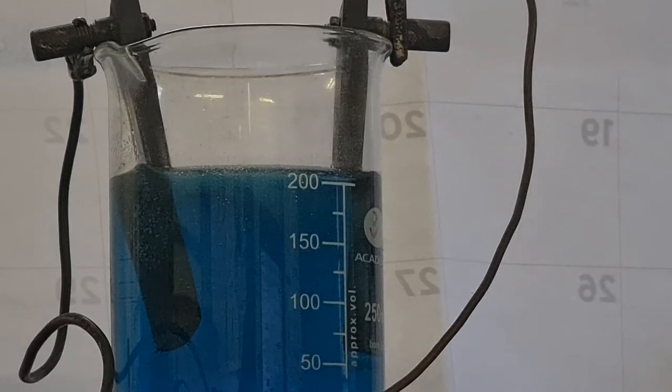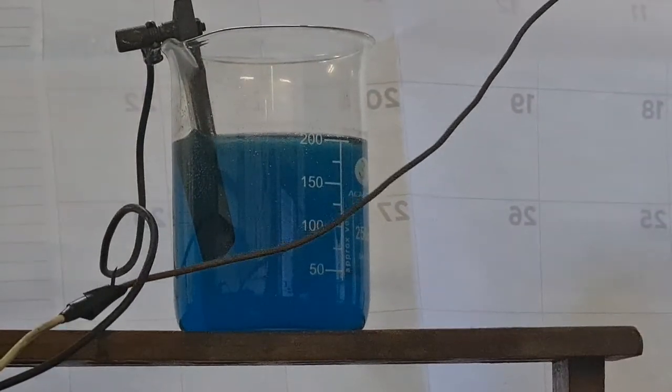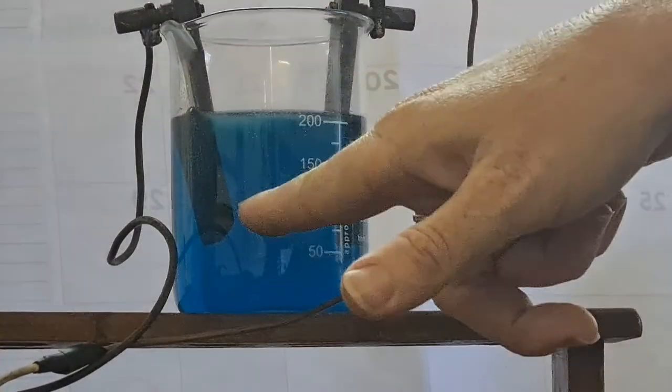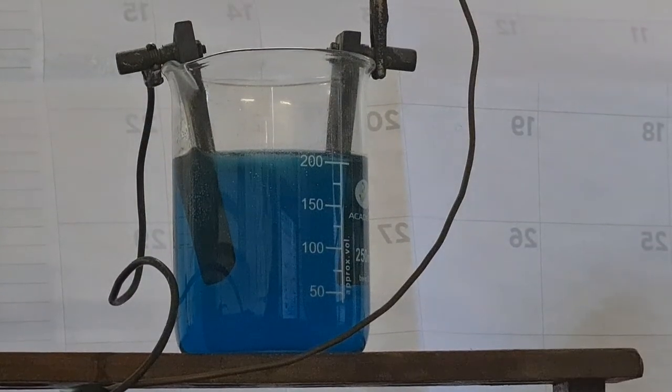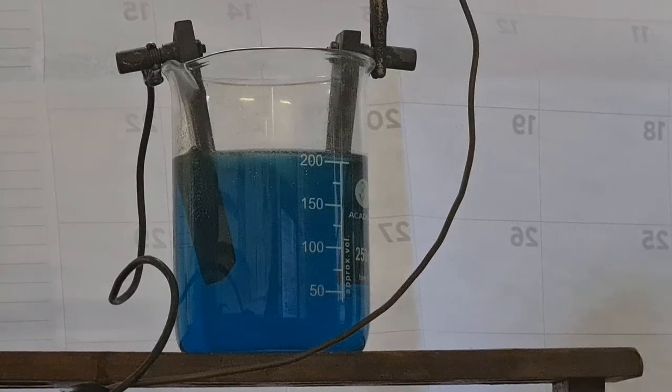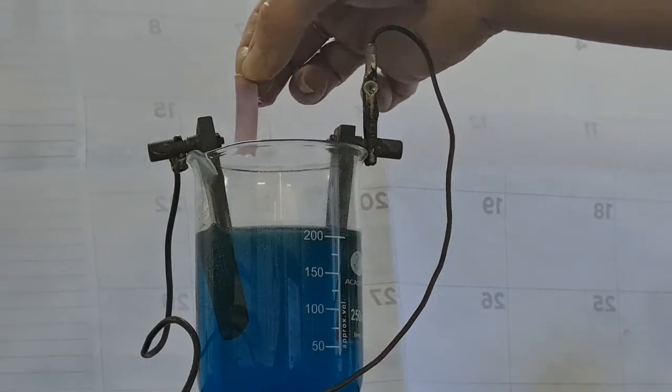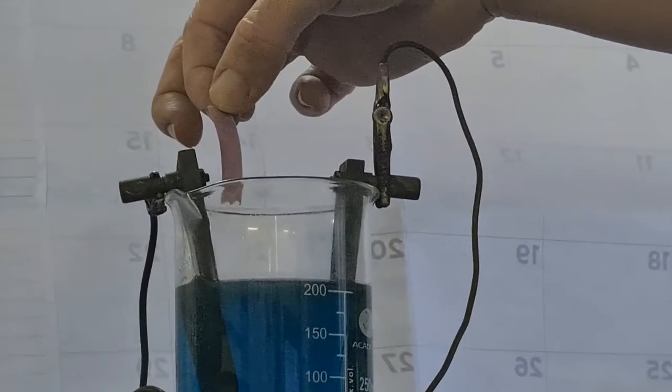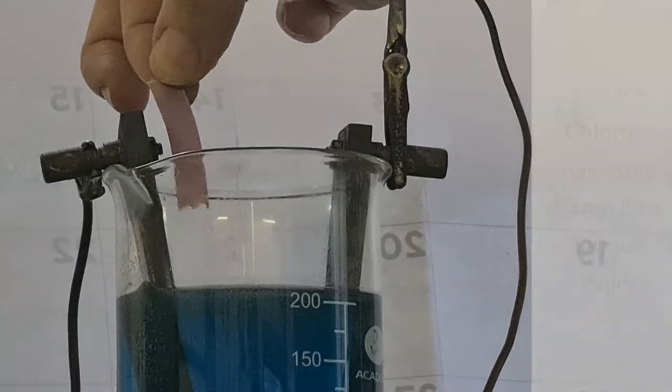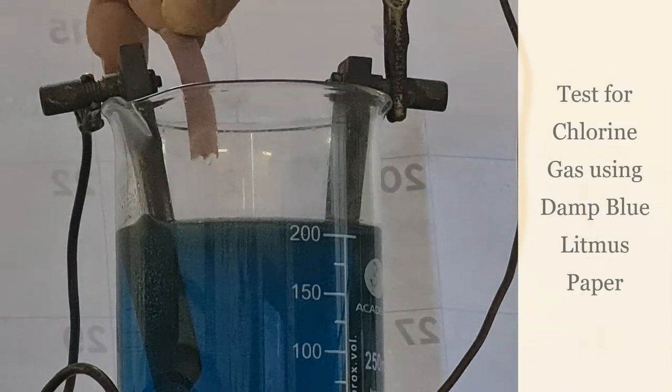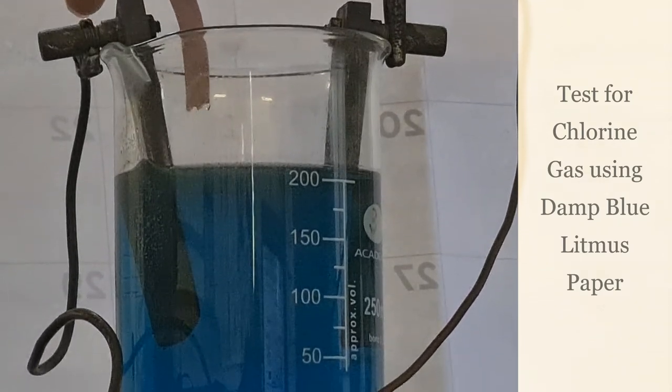We've got some electrolysis of copper chloride here, which I've shown you before. At the cathode, copper is being deposited, and at the anode, we have chlorine gas being produced. I want to show you the test for chlorine gas. We have blue litmus paper. I've just dampened it with some distilled water. I'm just going to hold it above where the chlorine is being produced. The test for chlorine gas is it turns blue litmus paper pink and actually bleaches or removes the color from pink litmus paper. It starts to bleach it to a sort of almost white color.